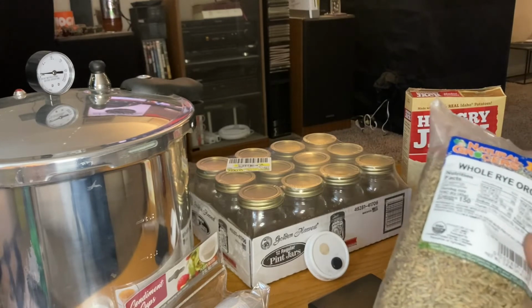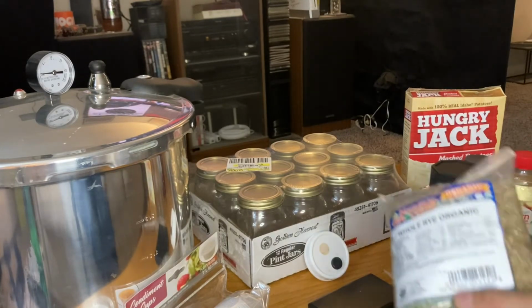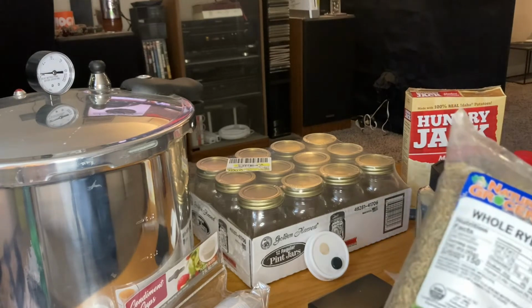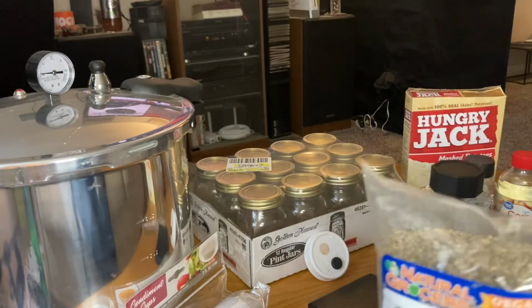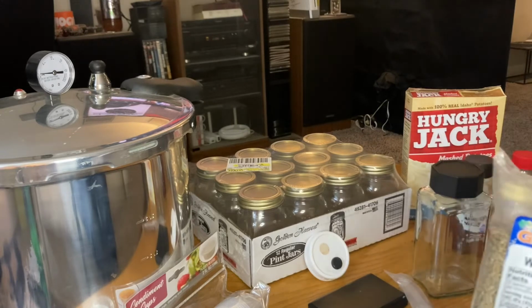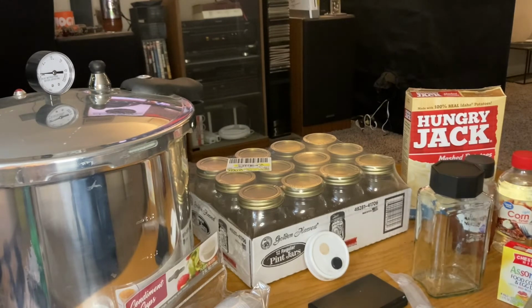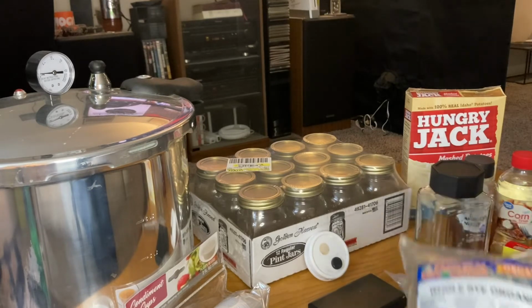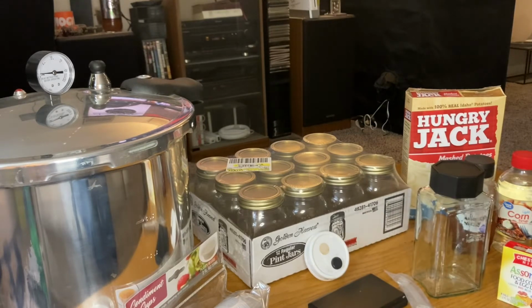I think they're a little more than a pint, the ones that I use. The ones that I got right there are actually pint jars. The ones that I'm able to fill 3 to 4 of these with, I actually got from Midwest Growers, and I've just been reusing them. But one bag will fill about 3 to 4 of those. So I'm guessing about 3 to 4 of the pint jars as well.